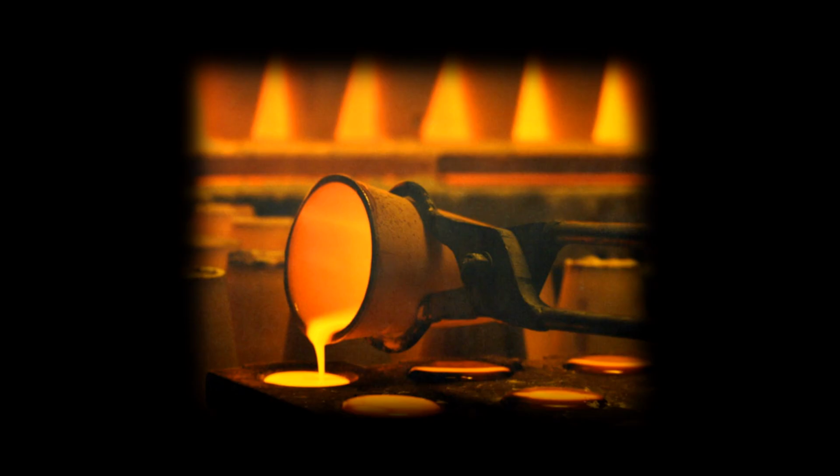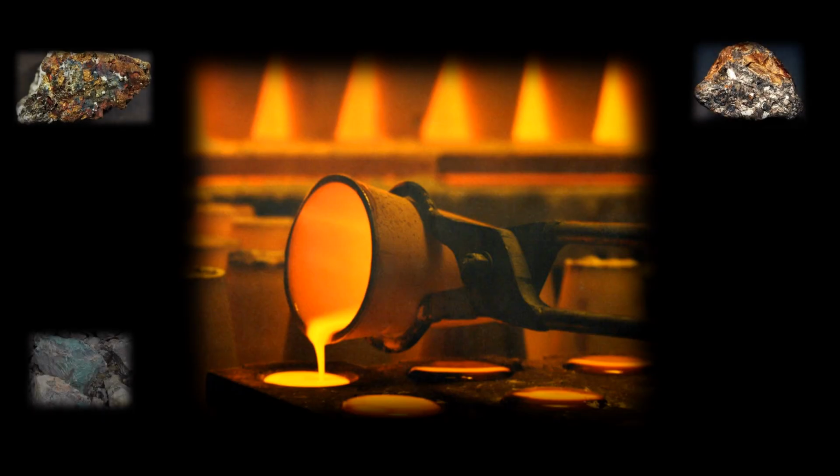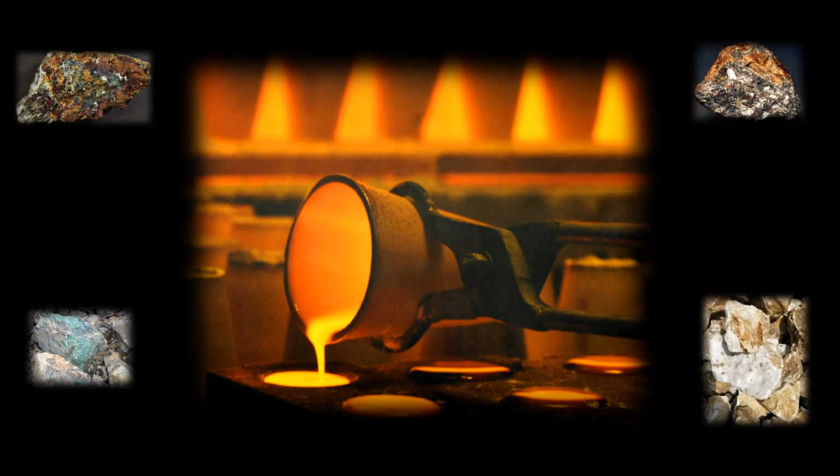Fire assay is a method that was mainly used for the separation and the analysis of gold and other precious metals. But what about copper, antimony, cobalt, barium, and other industrial metals of interest?